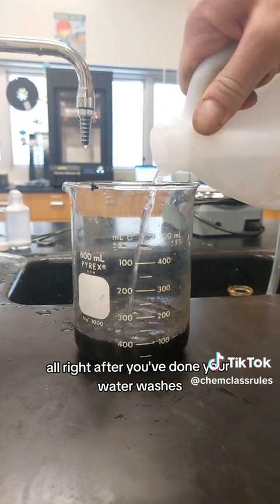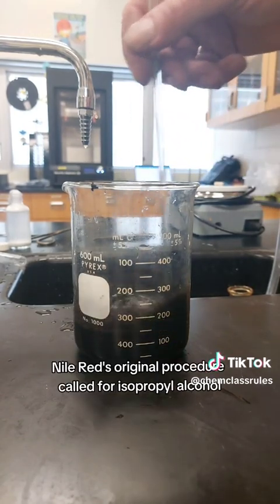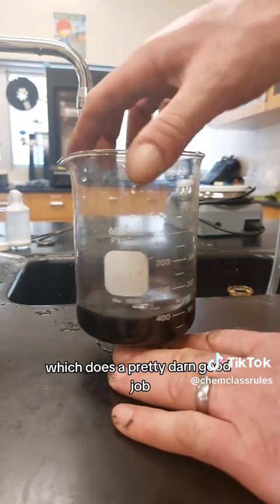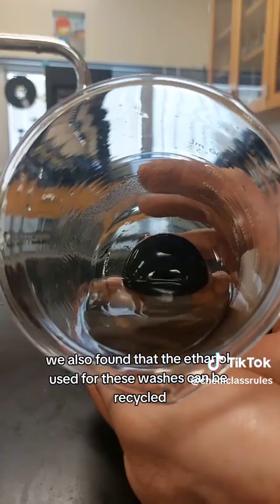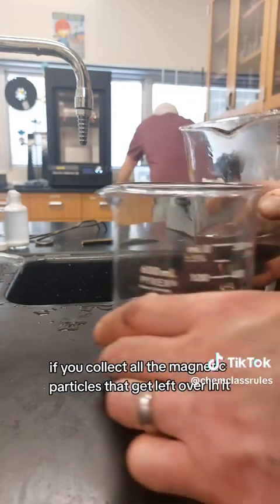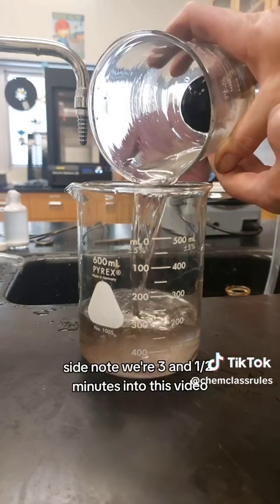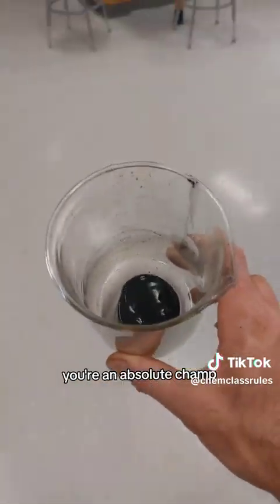After you've done your water washes, you're going to wash with alcohol a few times. Nile Red's original procedure called for isopropyl alcohol, but we found ours to be a little short in supply, so we're just using ethanol here, which does a pretty darn good job. We also found that the ethanol used for these washes can be recycled if you collect all the magnetic particles left over in it and filter it afterwards. Side note — we're three and a half minutes into this video, so if you're still watching, you're an absolute champ.